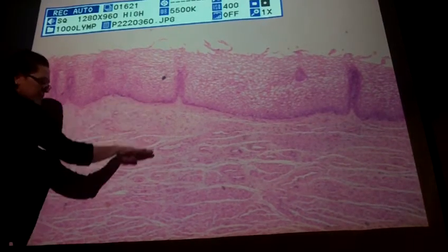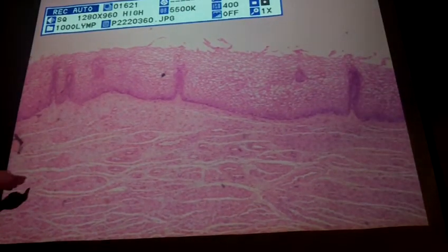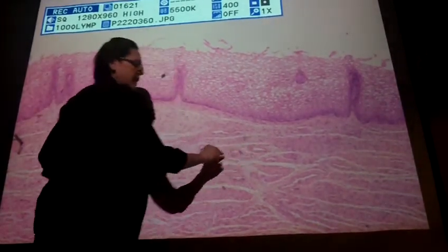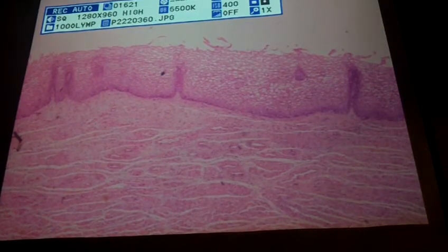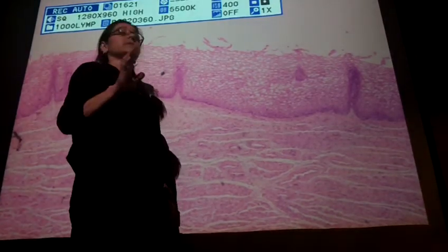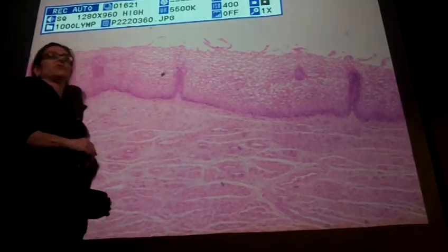When you go from this part down, this is the smooth muscle of the vagina, and then these little circles here, those are just glands that are releasing mucus. So those would just be rings of simple cuboidal epithelia. But the key thing that you want to look for is, for the reproductive system, the only structure that has stratified squamous epithelia, that's the vagina.